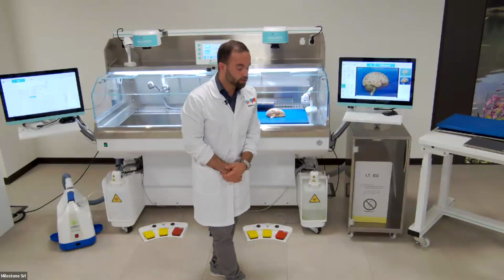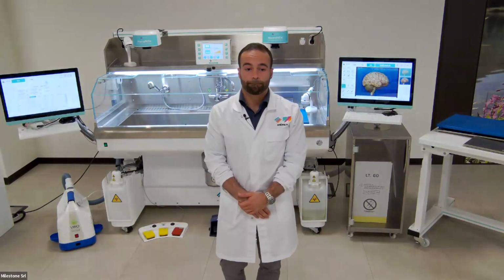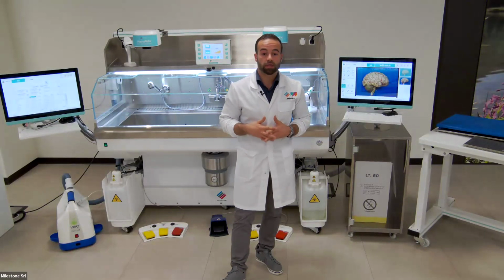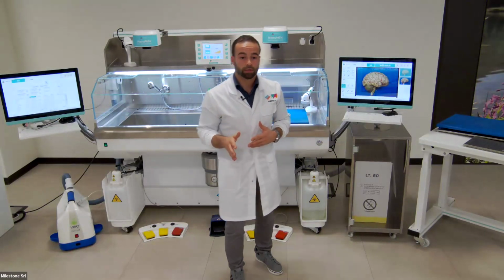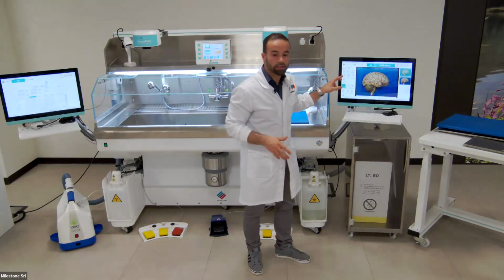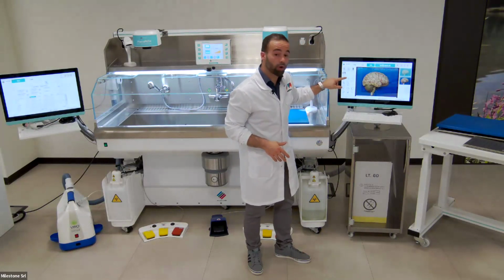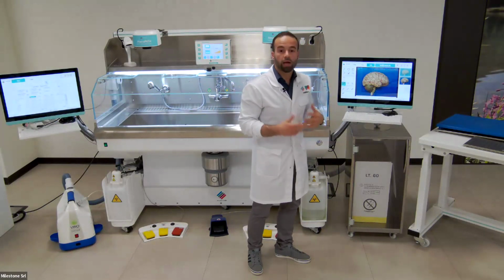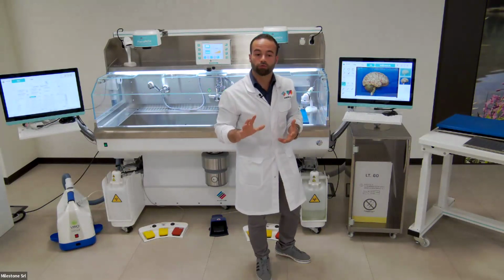Okay, let's continue with another question about documentation. You mentioned that you can edit the pictures. How is it possible? With our last version, we improved a lot the possibility to edit images directly on the screen. On the left part, we have the editing tool, and now I'm performing, for example, a sizing of the area.